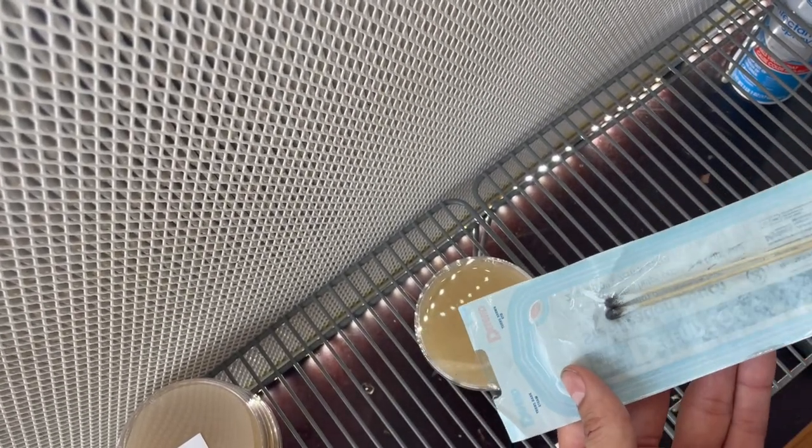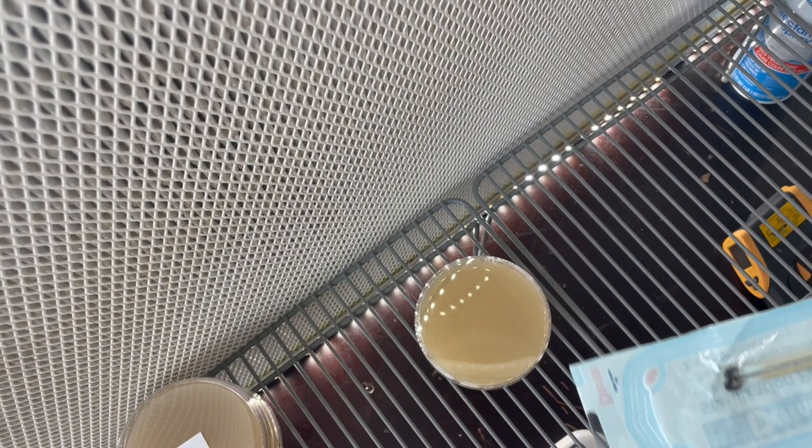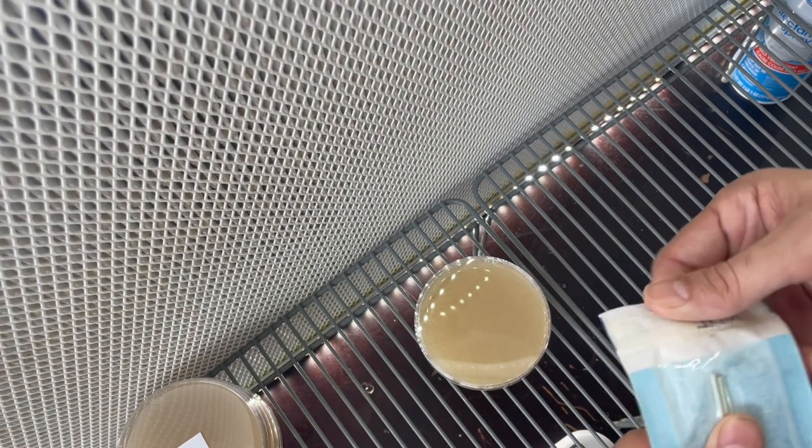Today we're going to be working on getting spores that are on a swab onto agar, and this is a very effective way to do this.